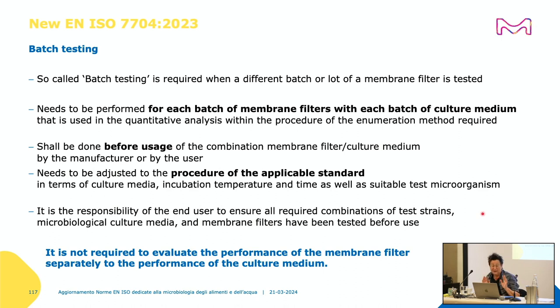And what is a little bit positive, we have to say, we know it is big, additional testing, but it is not required to evaluate the performance of the membrane filter separately from the performance of the culture medium. Means if you have a new batch of culture medium and a new batch of filter, you can test both together. If both together are working well according to specifications, you can release both together. At least, I know, a minimum, yes. So you do not have to test filter or culture medium before.